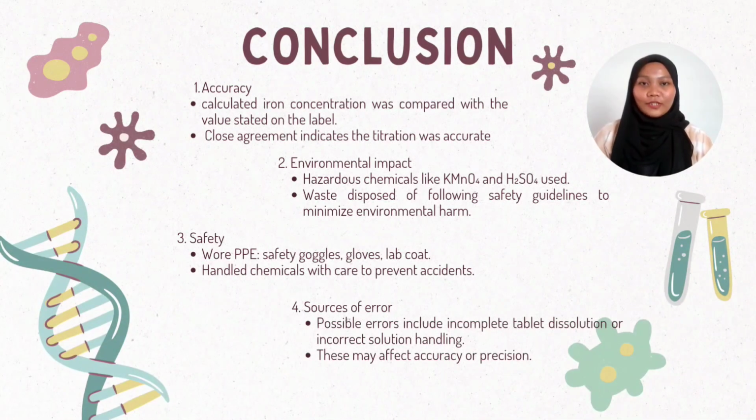In our conclusion and evaluation, we considered that there are four key aspects. Firstly is accuracy. The amount of iron we found was very close to the value on the label. This means our titration gave a correct result.